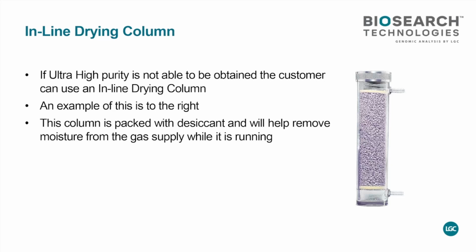People who work in the chemistry lab are fairly familiar with this substance. When it's dry, it's blue. When it turns wet, it turns pink. So that's the time to pour this out and pour a fresh one in. This can be put between the gas tank and the instrument, hence minimizing the amount of water in your gas.